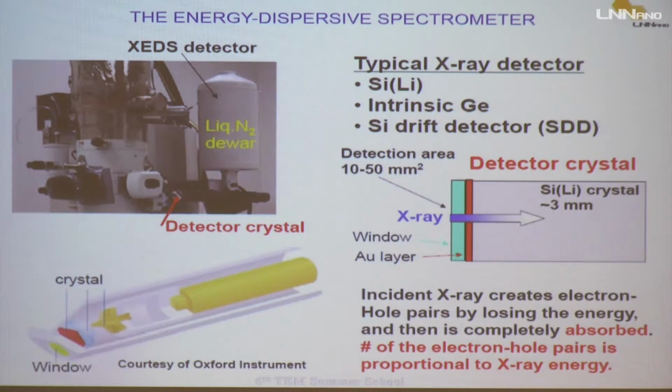Well, here is what the energy dispersive spectrometer looks like. This is an old one, the conventional Si(Li) detector, the silicon lithium detector. Now we can say it's an old-fashioned spectrometer, because now we have a brand new SDD. This is why I'm not making it a demonstration, okay?